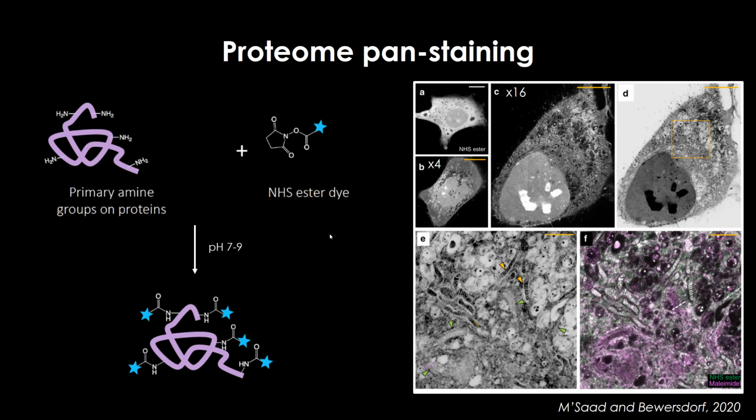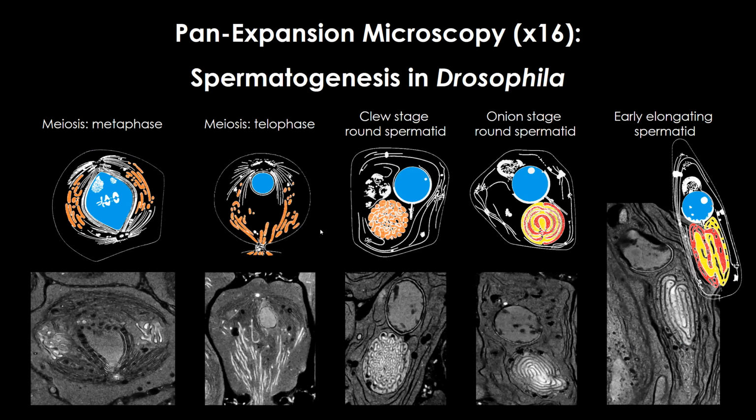So let's see, sorry, this one jumped. Here you can see the images that I obtained using this technique, the ultrastructural expansion. You can really appreciate how nicely I can see different parts of the cell and their architecture. You can see the nucleus with both of its membranes. This is the Nebenkern, the mitochondria that I look at.